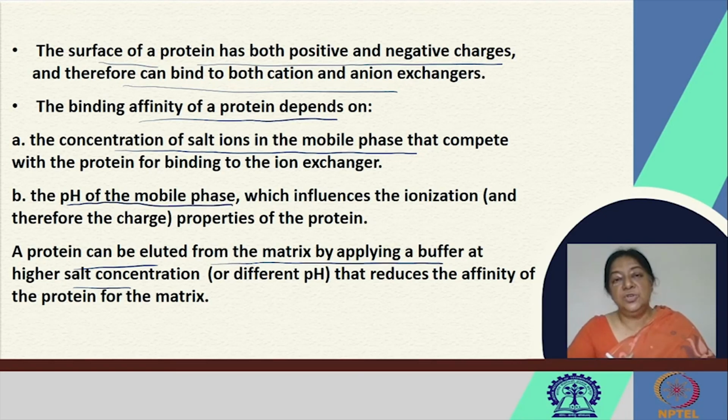So in ion exchange or any affinity chromatography, the protein is bound to the column. Now we have to elute our protein of interest. In ion exchange chromatography, usually the ionic strength is increased. If we increase the ionic strength of the buffer that we are flowing through, for example, the concentration of NaCl, then if this is an anion exchanger, Cl minus will bind to the beads and we will have the removal of the protein of interest.